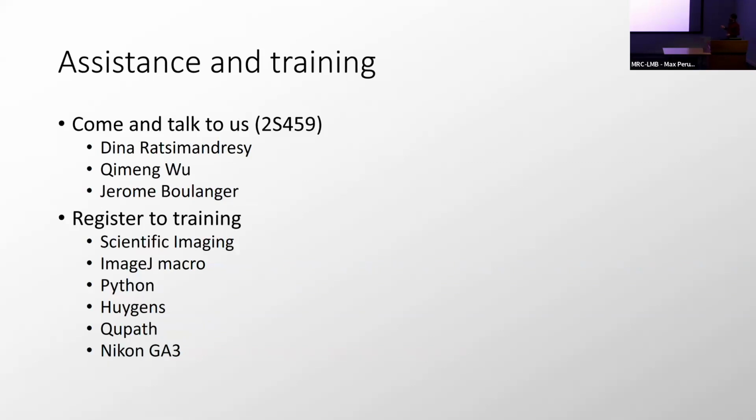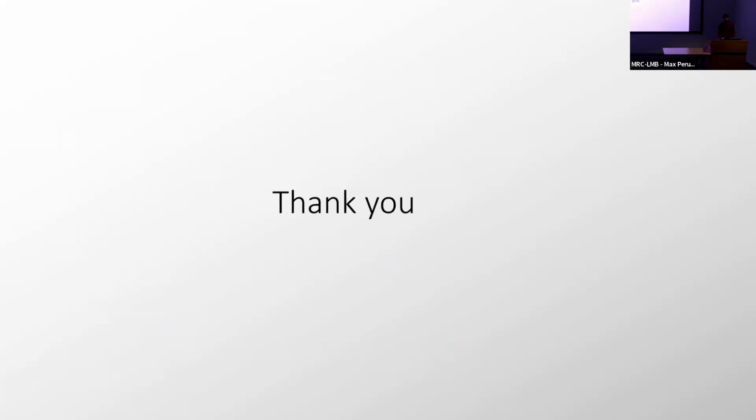We have 3 image analysts. We can advise you or help you write code. And then we also propose several trainings: scientific imaging with Fiji, for a more hands-on approach, how to script using ImageJ macros, how to define workflows using ImageJ. We have a Python-based course by Dina. QuPath is coming with CMENG, and we also propose GA3 training sometime. So just look for them when we announce them, and thank you for your attention.